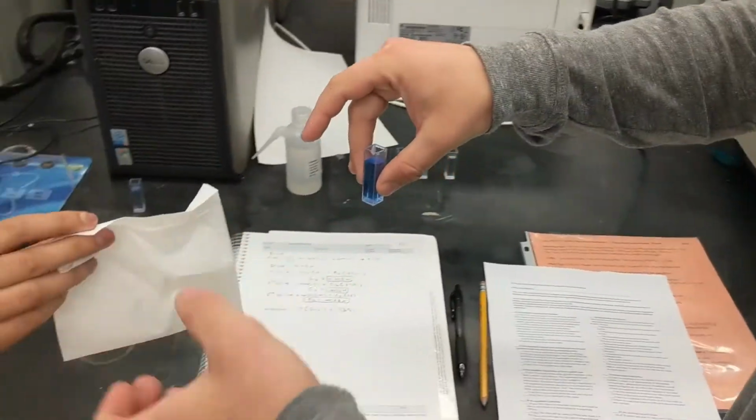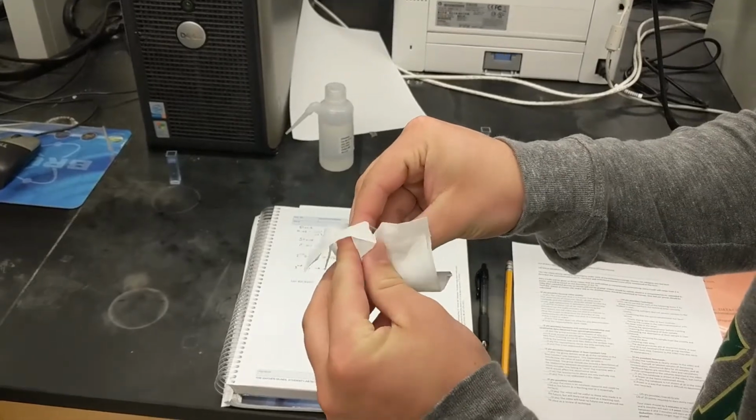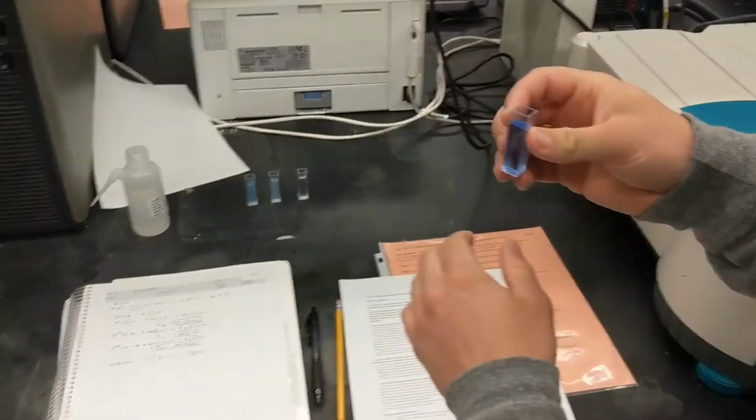Next, do the same with your first dilution. Clean the sides, open the machine, and carefully insert it. Close the lid, and this time press read. You will be given an absorbance value. Record this in your notebook. Repeat this step for all of your dilutions.